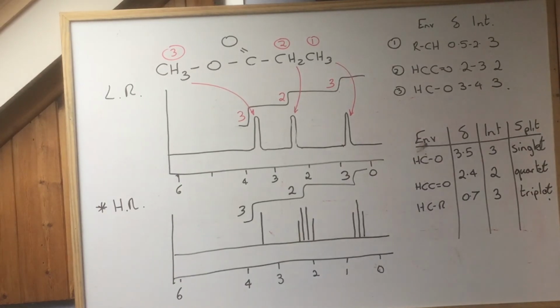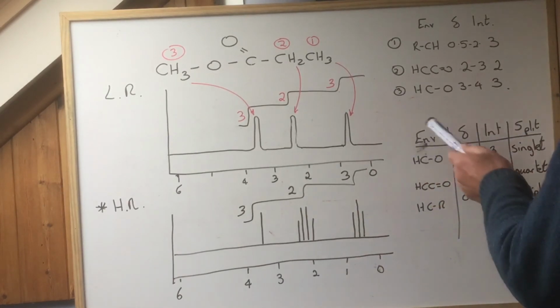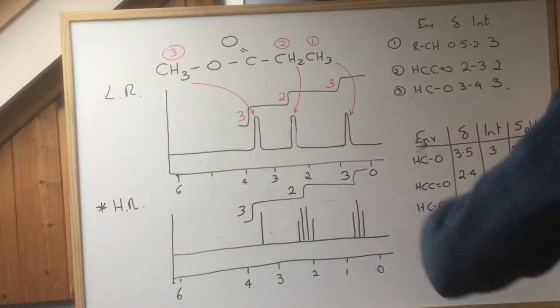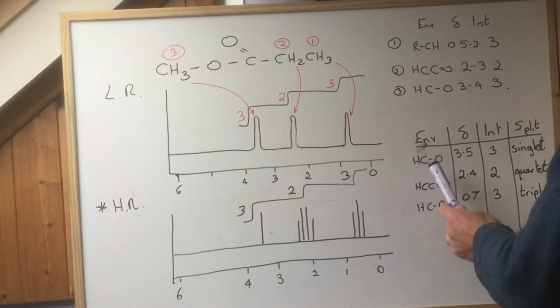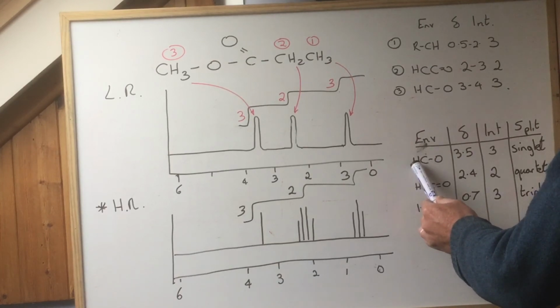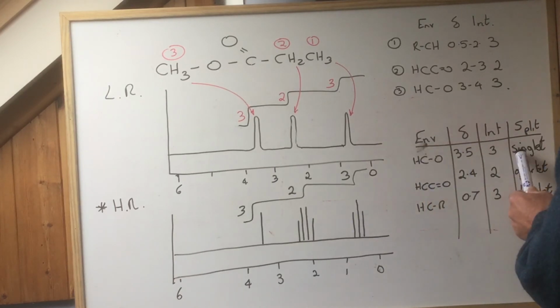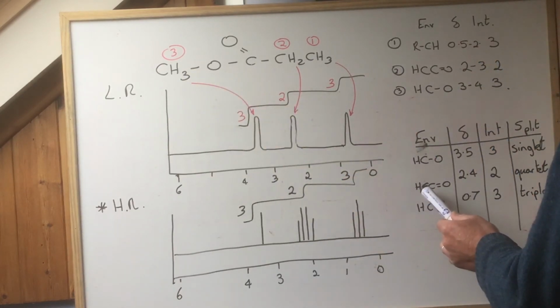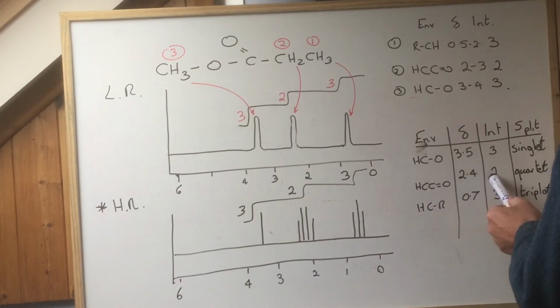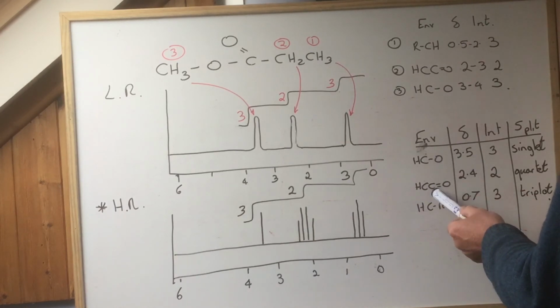So there you are. Essentially, you should be able to take that spectrum, produce a table like I've done there, and then you've got to put your thinking cap on. Looks to me like there's an ester, looks to me like the protons in that part of the ester, you draw it out, you play with it, you visualise it, are isolated because they've not been split, so there's nothing else going on there. Looks to me like the protons attached to that carbon, there's 2 of them, which is what I would expect. CH2 there, I'd expect that. That's backed up by that, in the right position for my ester, but split into 4.